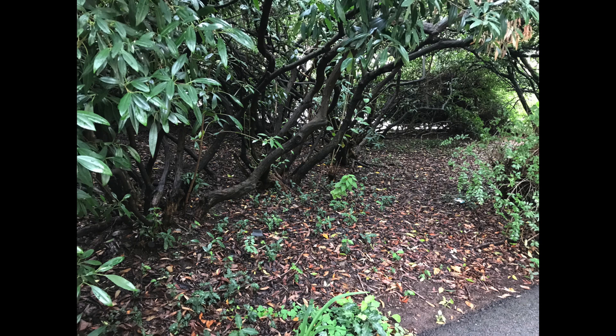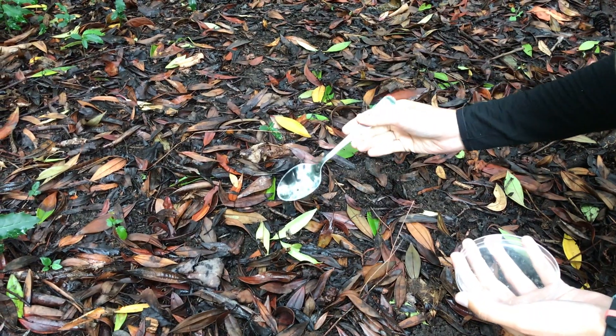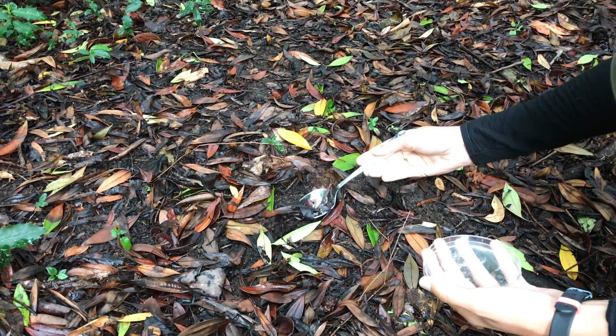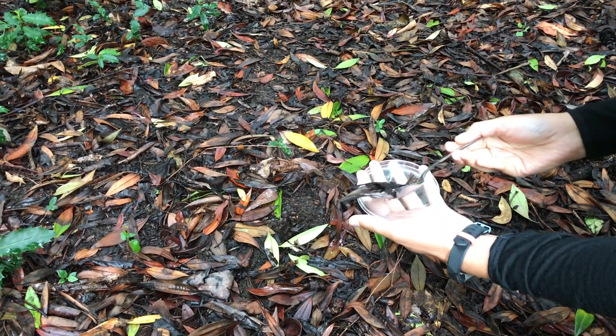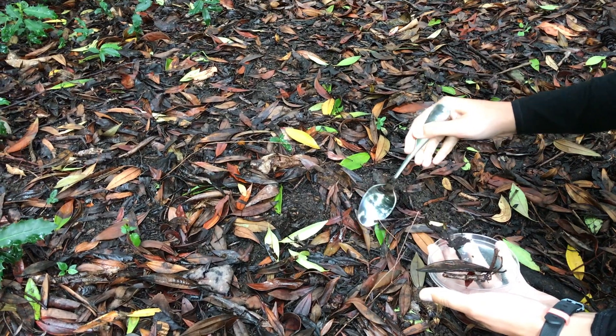When you're looking for places to find your invertebrates, look for shady spots under plants like trees and bushes where lots of leaves and twigs have fallen on the ground. Collect some plant matter and soil into your petri dish so that the animals you collect have somewhere to hide while you observe them, and are more likely to stay inside the dish while under the microscope.